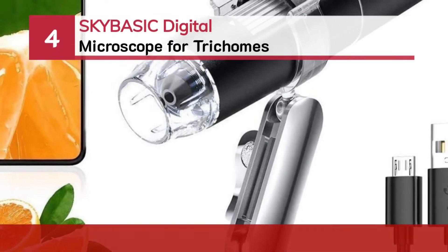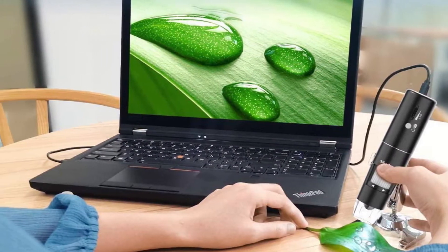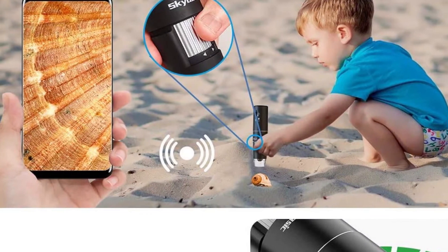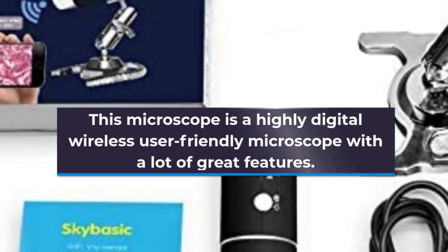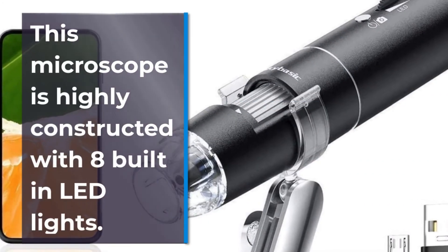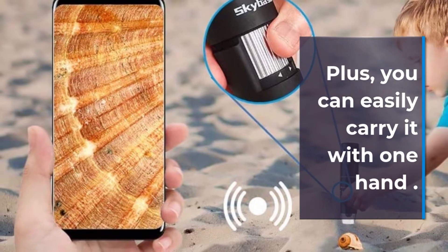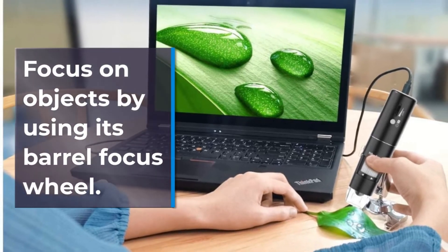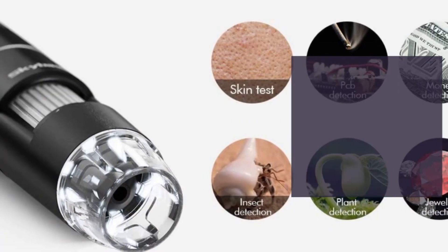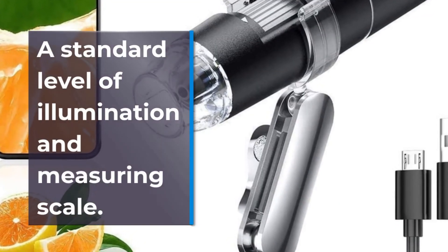Number 4: SkyBasic Digital Microscope for Trichomes. This microscope is a highly digital wireless, user-friendly microscope with a lot of great features. You can easily carry it with one hand. Focus on objects by using its barrel focus wheel. It gives you enough brightness adjustment, a standard level of illumination, and a measuring scale.